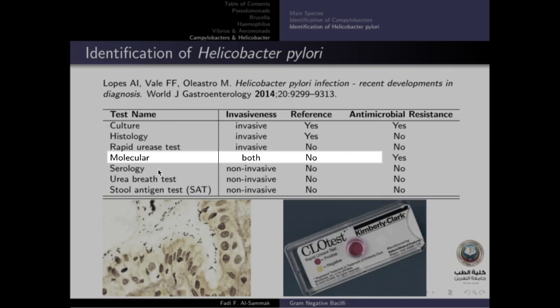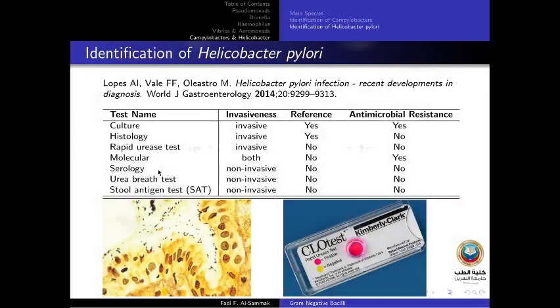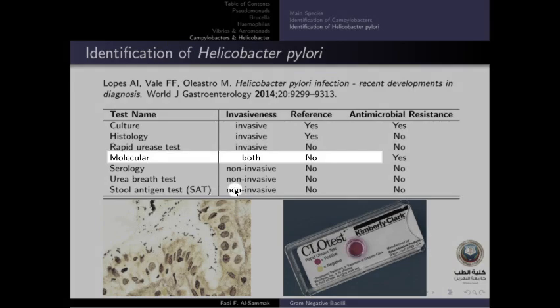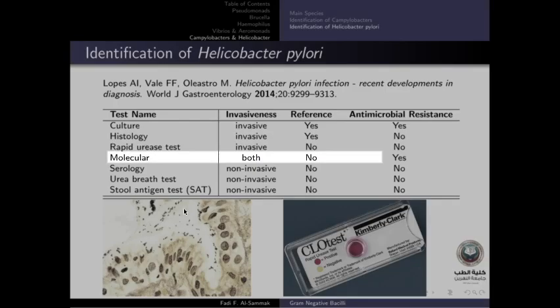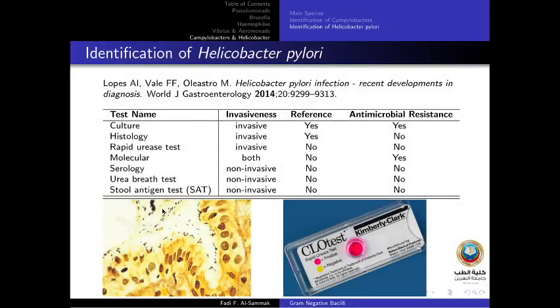Now, all that we mentioned, in histology it is the Warthin-Starry stain, and this is the stain.